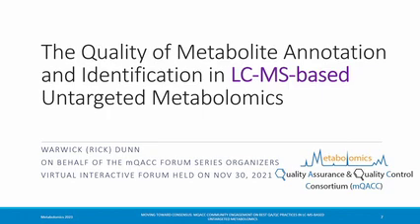So we're going to talk about metabolite annotation and identification in LCMS-based untargeted metabolomics. We're not going to talk about NMR or GCMS. That's something that will come in the future within mQACC. And most of what we're going to talk about today was based upon polling in an online workshop that was run about 18 months ago.